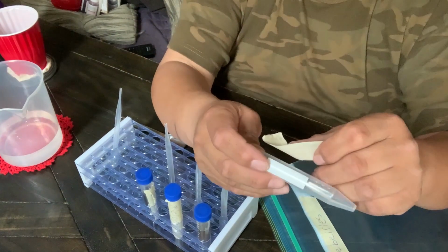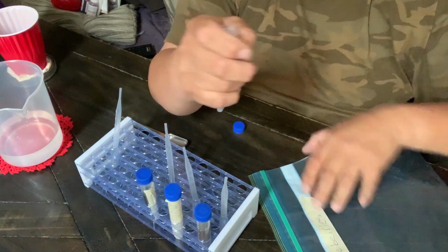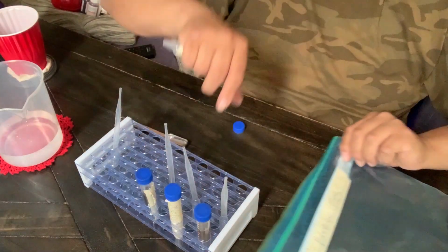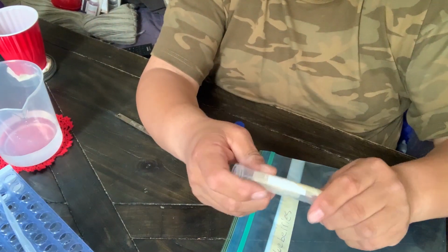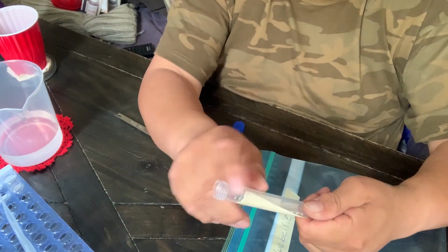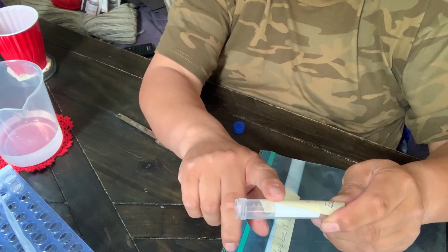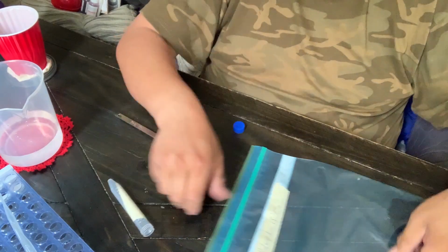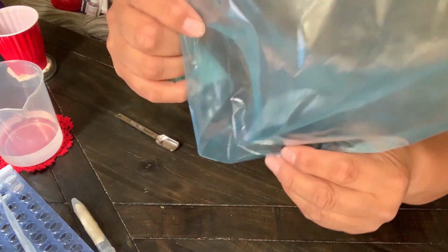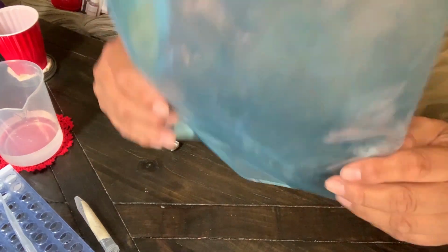All right, and then we just labeled this one here, blueberries. And then we have our blueberry samples there. All right. You just see how easy that is. Now, if you labeled it by writing on the test tube, well, all you have to do is put a piece of tape over that with the correct name, and you're still good. All right, so here's the blueberry sample. Let's kind of crush it up, shake it.